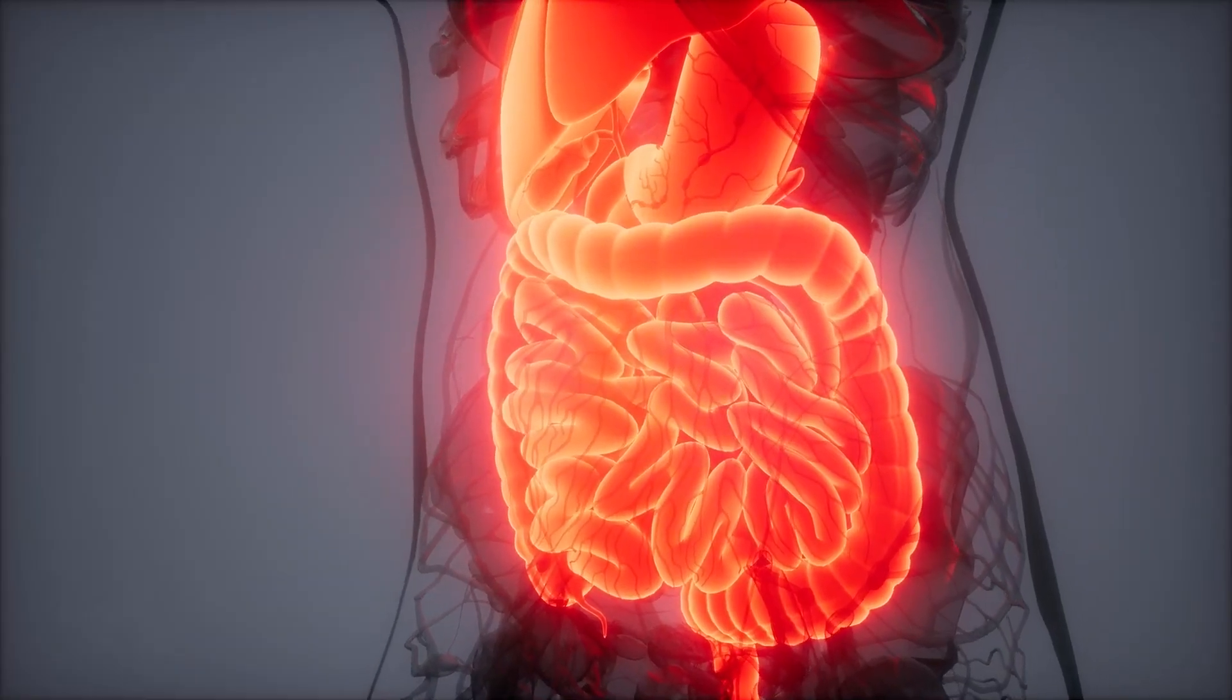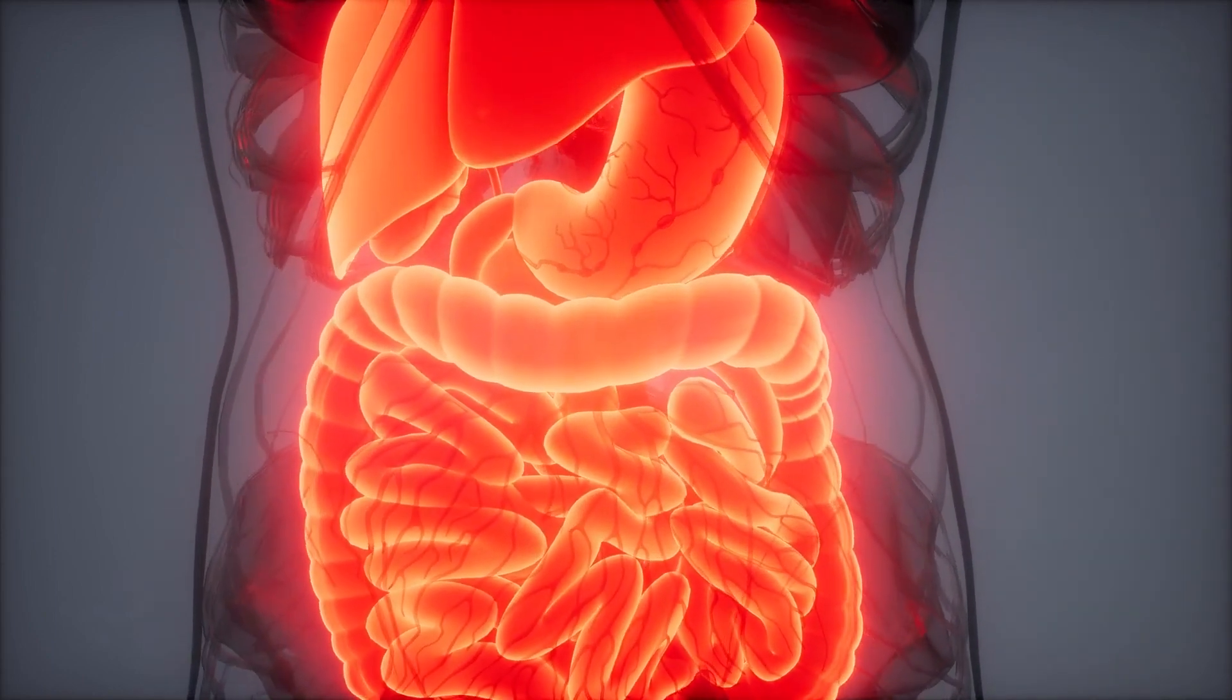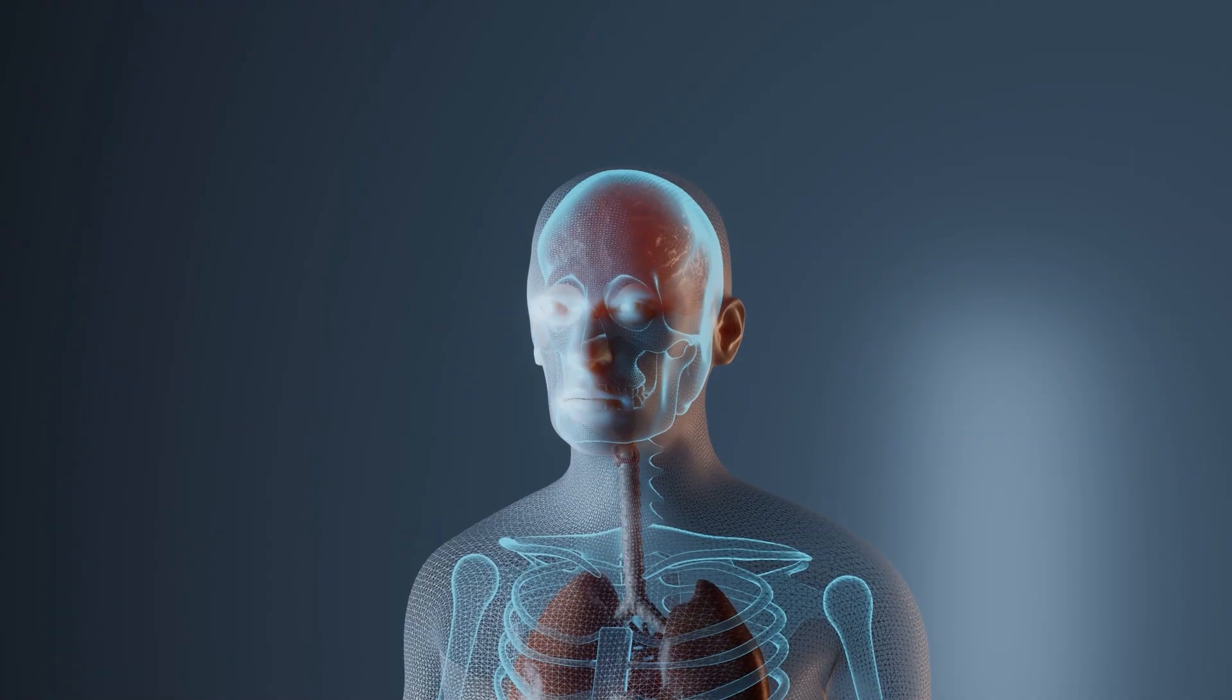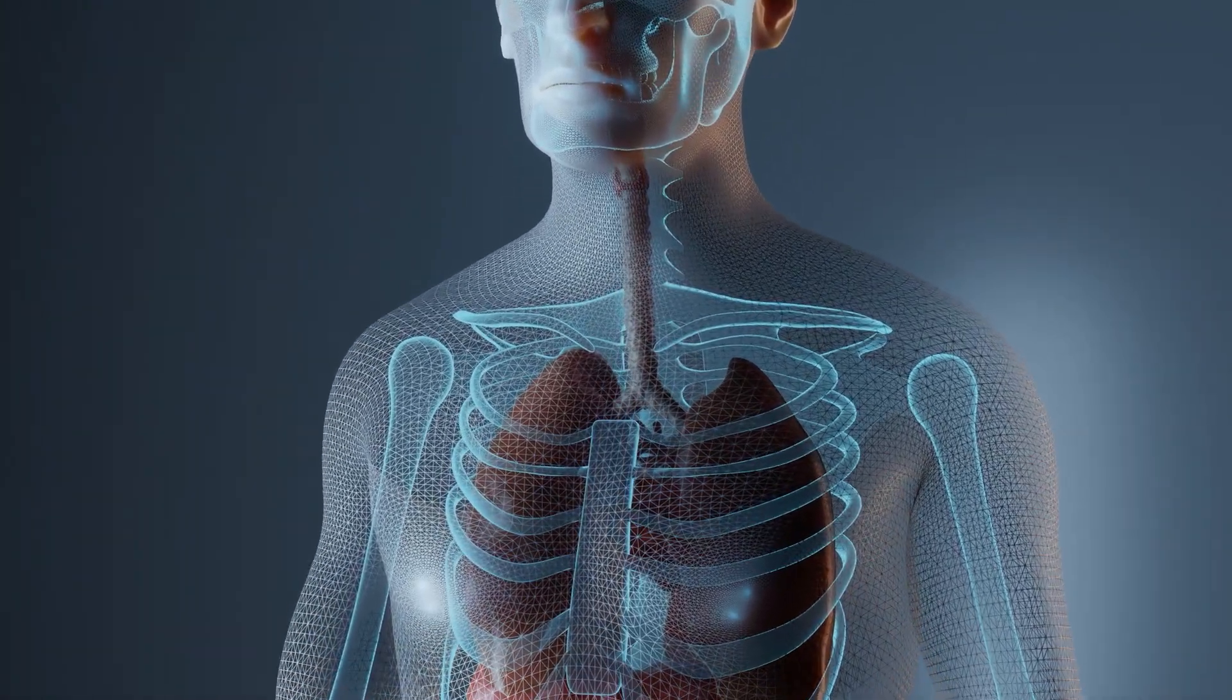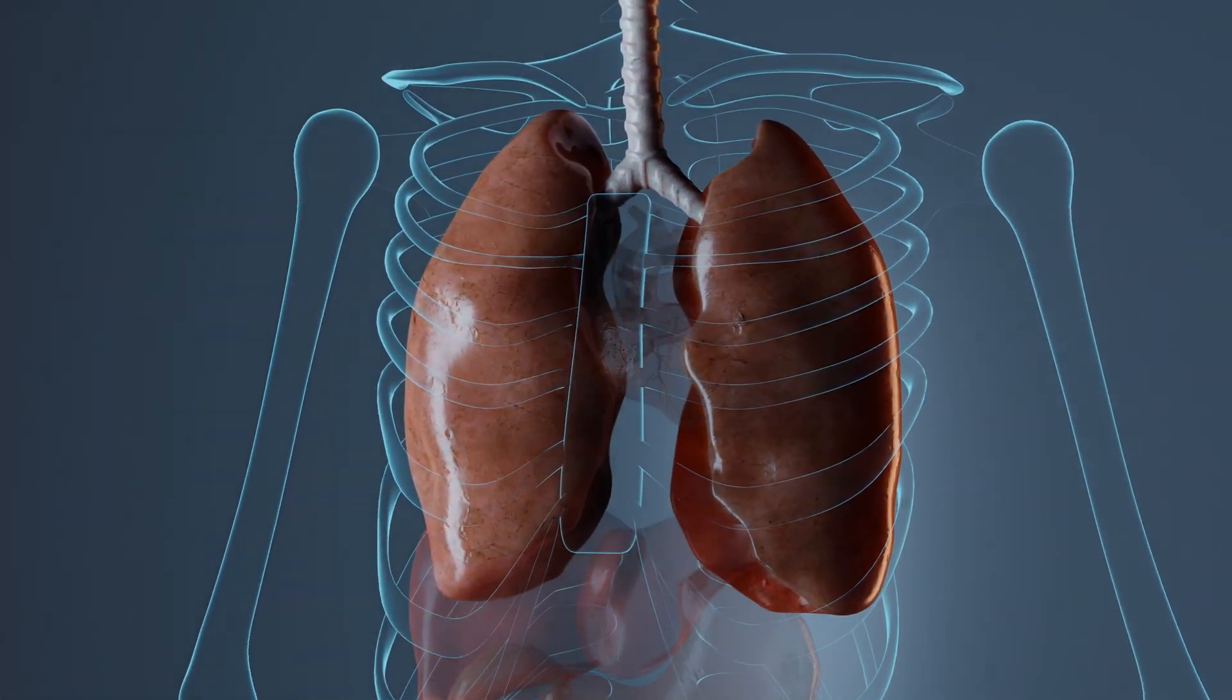Our intestine chip can recreate peristalsis which is so important for the tissue-to-tissue interfaces which are critical in human biology. The system is modular by design, it's extensible by design, meaning that you can add complexity if you need added complexity, and if you need a simple model you can have a simple model.